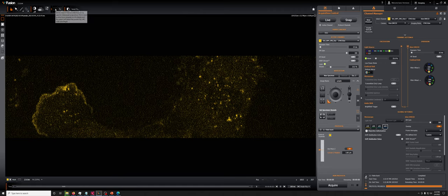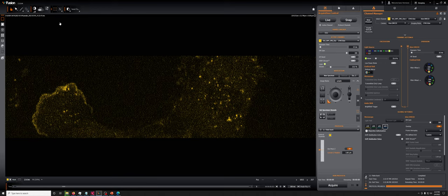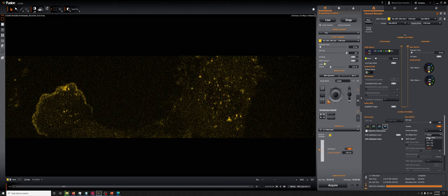So really, cropping can have a dramatic impact on your speed, and you only need to crop in the vertical dimension. And you can do so dynamically using these AOIs, this AOI tool here. If you want to go back to non-cropped, you can just go here and then snap another image.